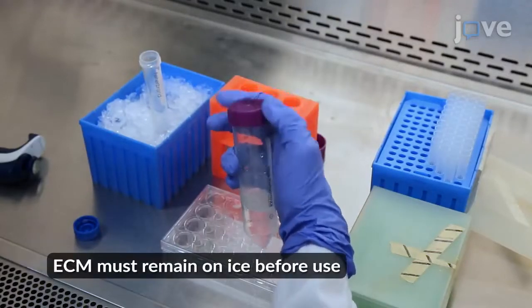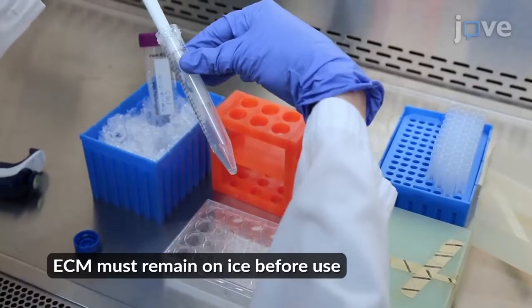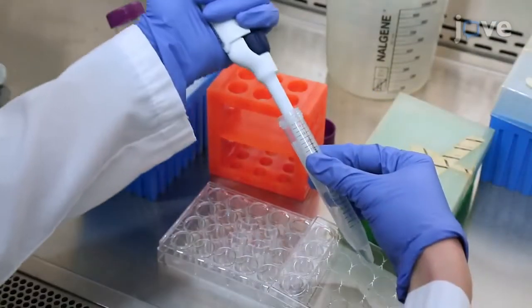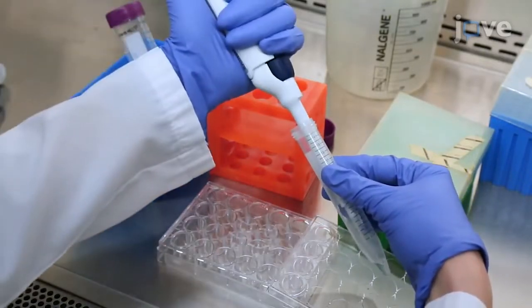Dilute the extracellular matrix, or ECM, 25-fold in cold sterile phosphate-buffered saline. Then add 100 microliters of cold diluted solution into each upper chamber onto the membrane.